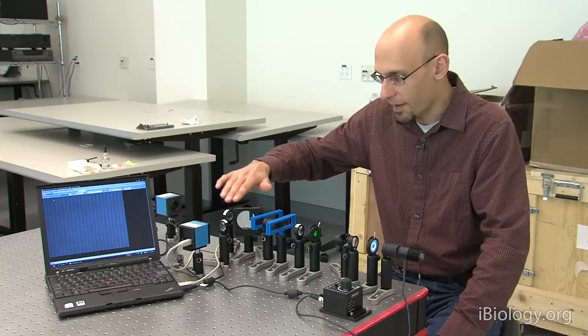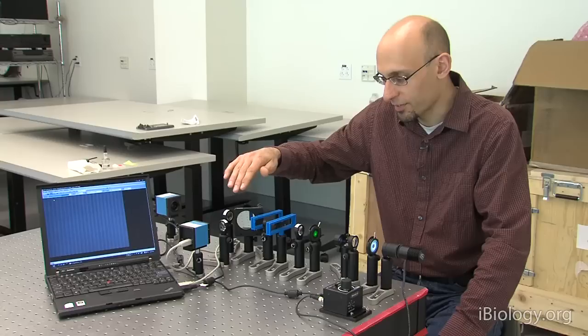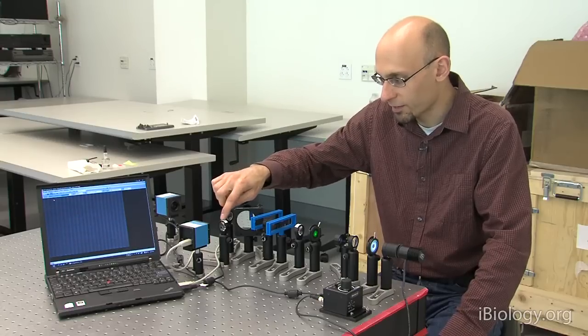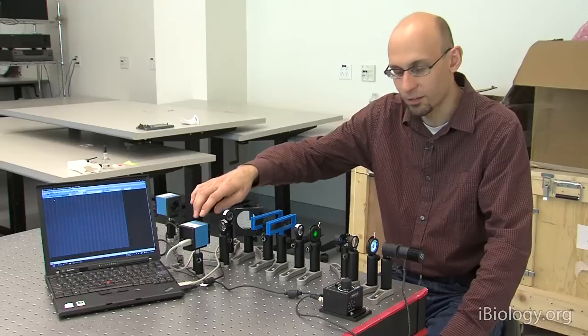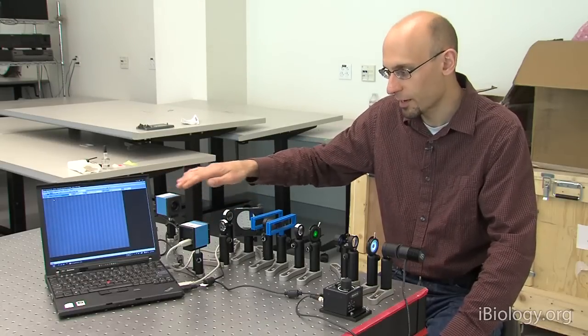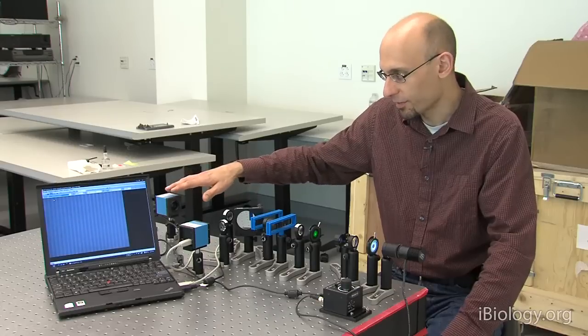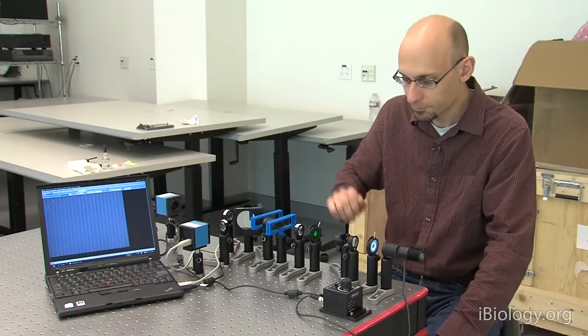The other path reflected off the beam splitter is a path that allows us to image the back focal plane. And so this lens here is acting as a simple magnifier lens to project the image from this back focal plane onto our camera here. And so on the laptop, I can switch between this camera and this camera to see either the sample plane or what's going on in the back focal plane of the microscope.